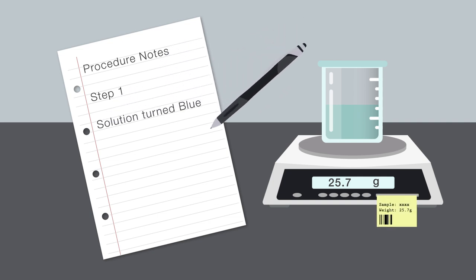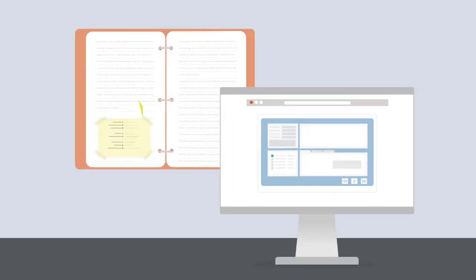After the procedure is finished, someone then has the task of transcribing all this information into a LIMS, so it can be stored with the record of the sample used in the procedure.